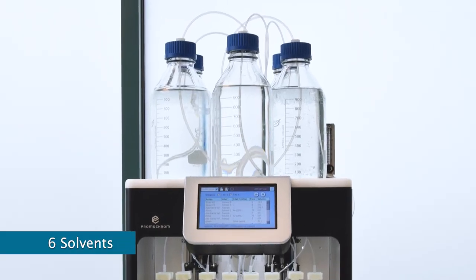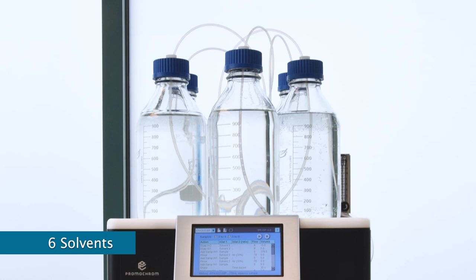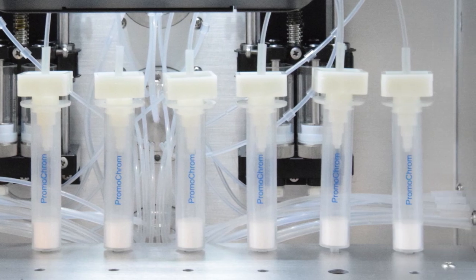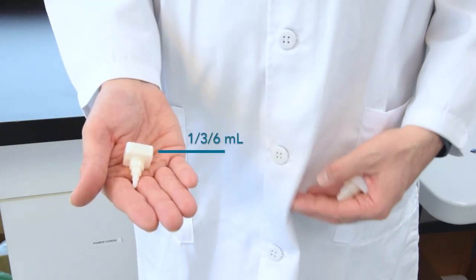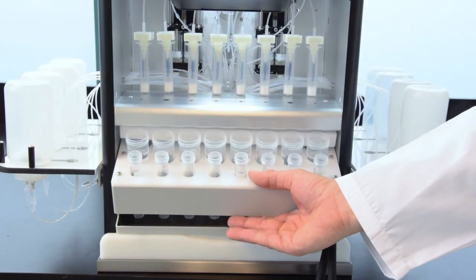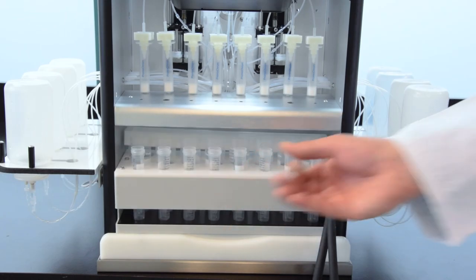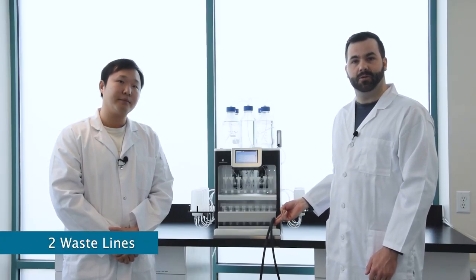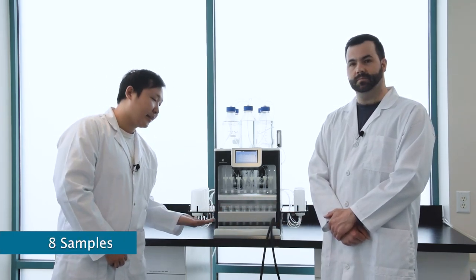Up to six different solvents can be mounted on top and we'll be using five for EPA Method 1633. The SPE cartridges are easily accessible from the front and we offer adapters compatible with 1, 3, 6, 12 and 20 milliliter cartridges. Up to two fractions can be collected and easily accessed. And the two waste lines here serve to separate aqueous and organic waste. The samples we have here are mounted with four on each side, similar to the configuration for EPA Methods 537 and 533.